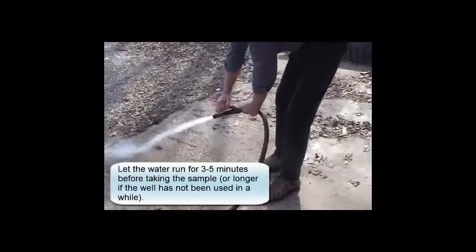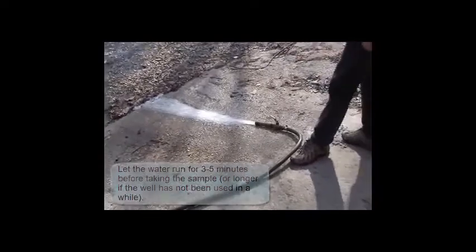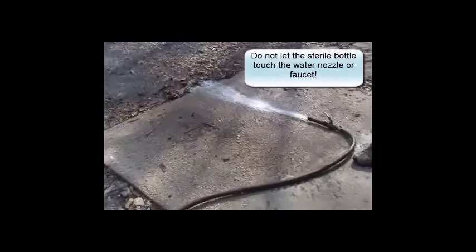When sampling a well, let the water run for three to five minutes before taking the sample. Do not let the bottle touch the water nozzle or faucet, and again fill it up to the line.